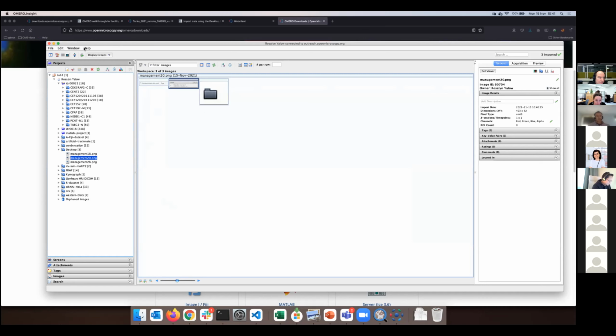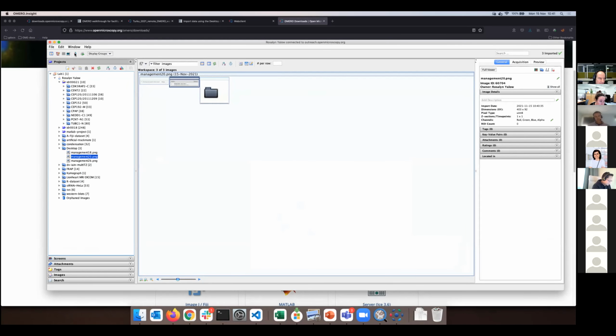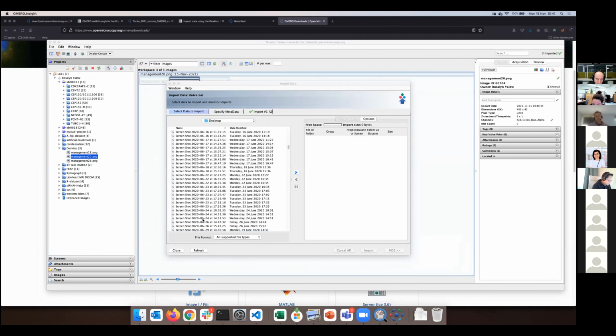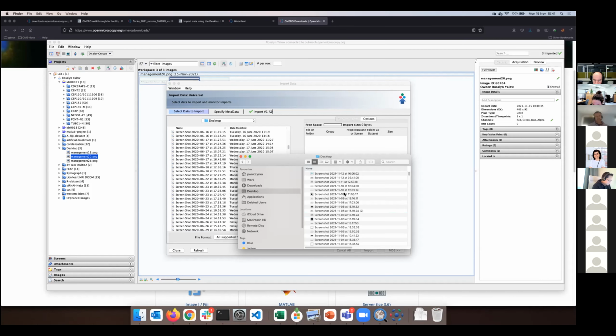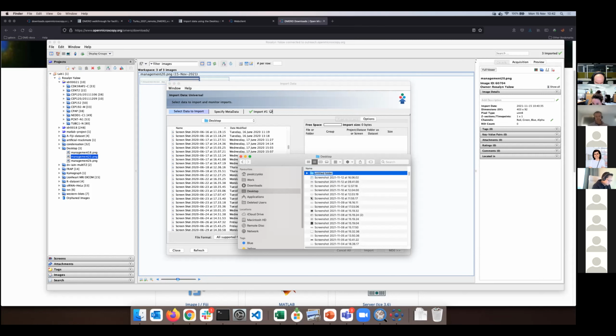I think that would be the very basic import. I can click again on that upward facing arrow and show you very quickly, in my local hierarchy, this is my Finder on my Mac. If I go into desktop and create a new folder, Turku import, all right.